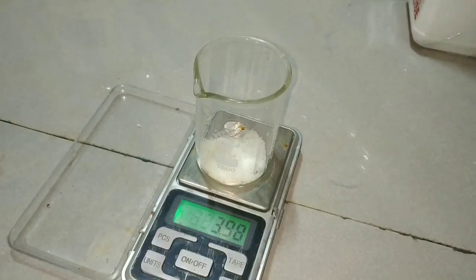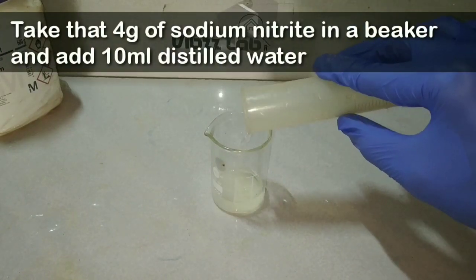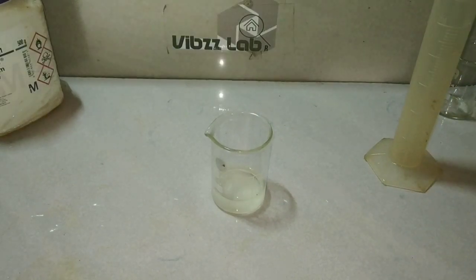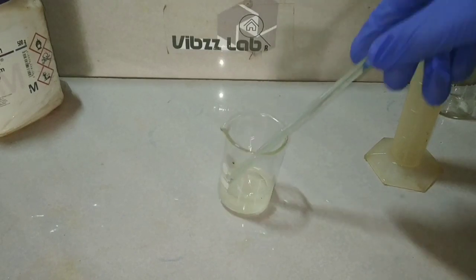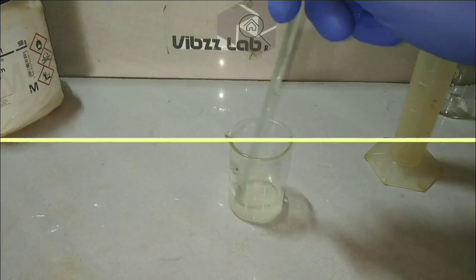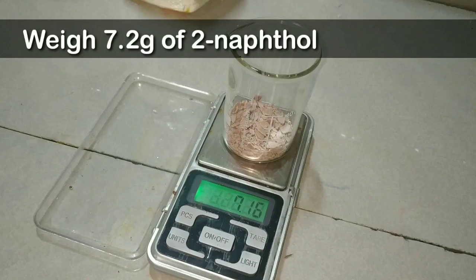After taking the approximate weight of 4 grams, we dissolve the sodium nitrite in a minimum amount of water — here I have taken 10 ml of distilled water. We then keep this solution in an ice bath to cool in a separate beaker, and we weigh around 7.2 grams of 2-naphthol, that is beta naphthol.